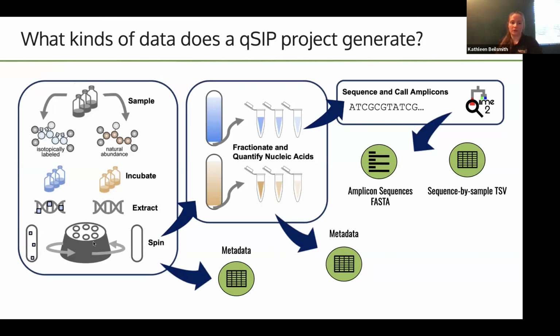And then you'll use the ultracentrifuge to stratify the nucleic acids in cesium chloride into regions of uniform density. And so at this point, you're going to have metadata for each of these processes that are associated with those sources. And they're labeled samples here. We'll get into that. All right, so there's metadata that's generated at this source level.